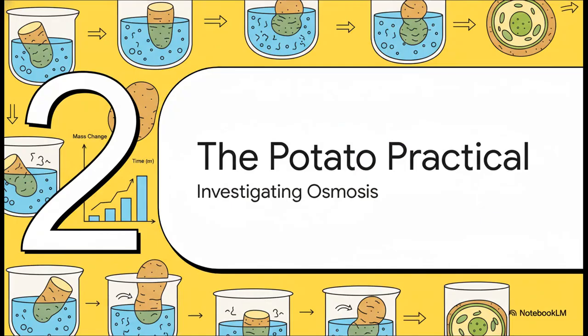Okay, theory's done. Now for the fun part. Let's apply all this to the practical itself. Required Practical Activity 3. This is where you get to see osmosis happen right before your eyes and collect data like a real scientist. This is where it all comes to life.